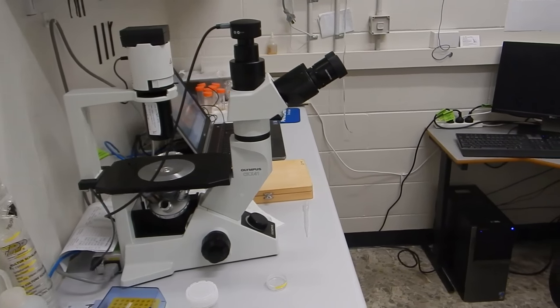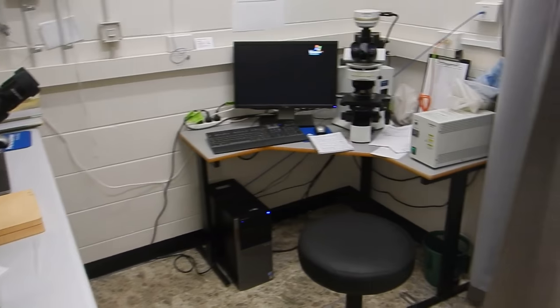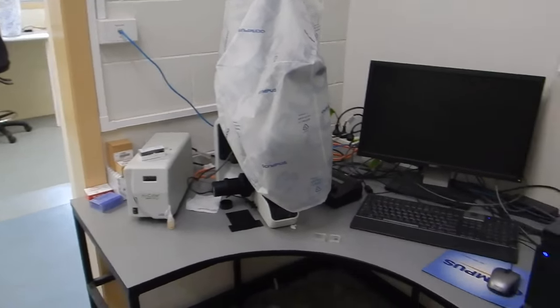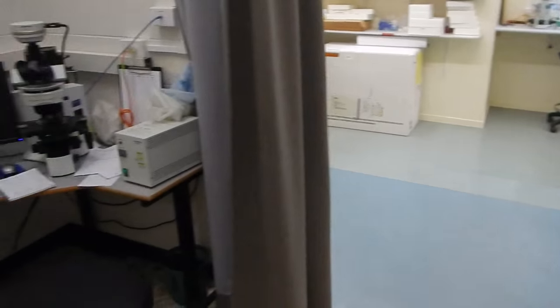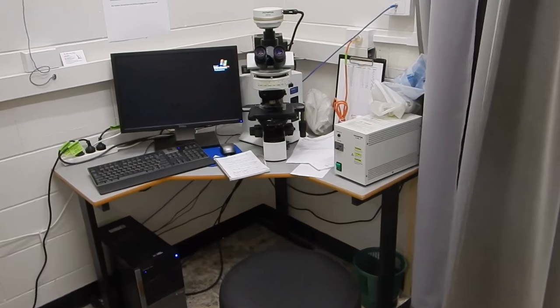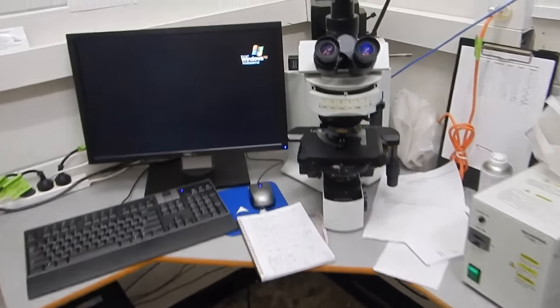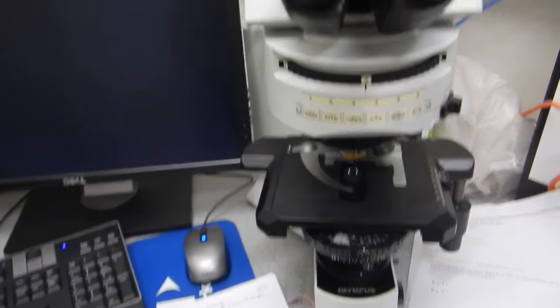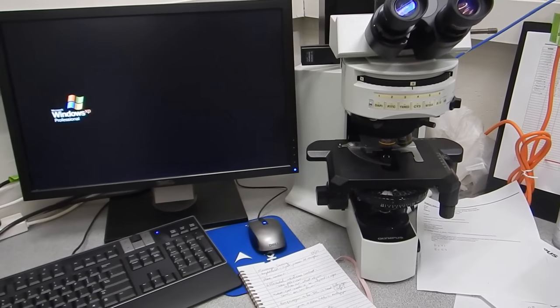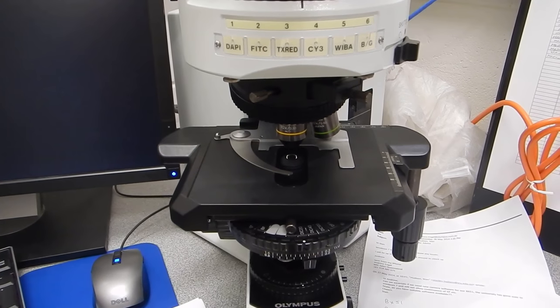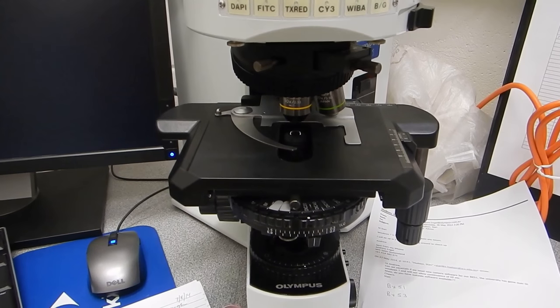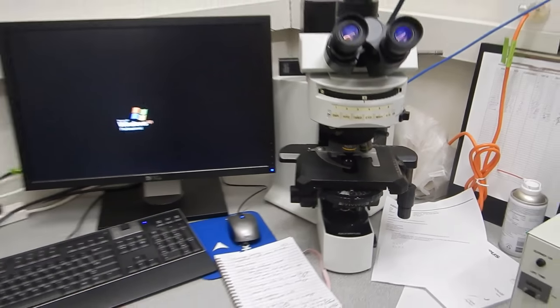Here I am in the digital microscopy lab, well, room of our lab. We have a couple computer stations set up with digital microscopes that can do light and dark field digital photography under the microscope, and also fluorescence and DIC, which we'll talk about later.